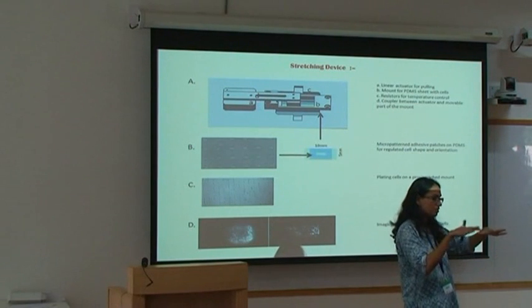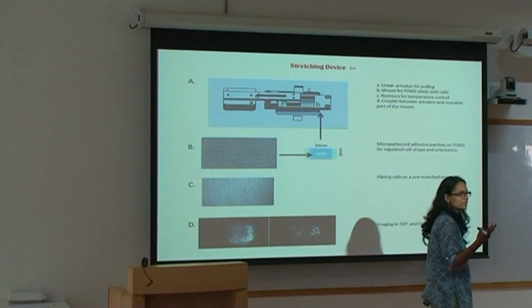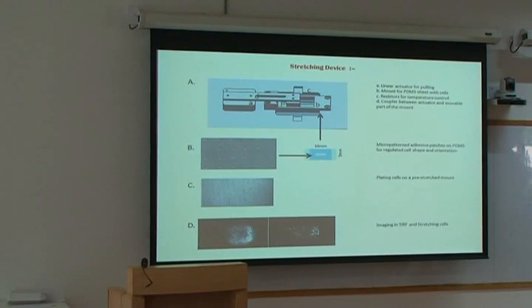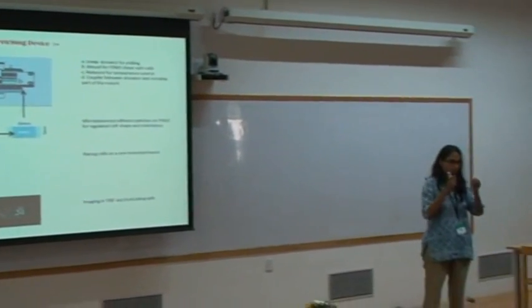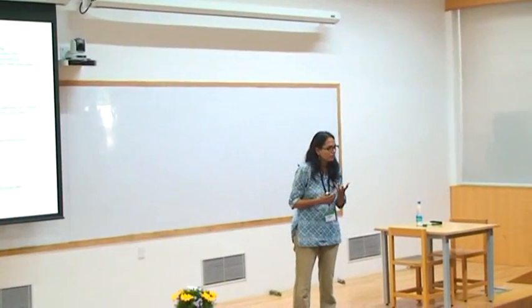It really depends on how your cells are sticking, how your PDMS is. So that's why you need clean room facilities usually. When you make PDMS, you're going from a non-crosslinked or fluidic thing to crosslinked things. Yesterday you saw we did that, and then we realized that when you mix the two, you have to mix really hard because both of them are viscous. We realized that it was important what we are mixing it in.